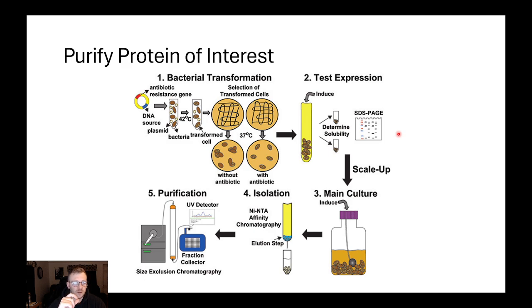And these ones they use, I believe, is a nickel metal that's conjugated onto the bead that is able to have affinity and bind, covalently or ionically, to the histidine residues on the end of my protein, so that my protein will stick to my beads inside my purification column when I run my cell lysate through it. I can then wash the beads in a specific buffer that will cause the beads to release the proteins that were on them, and then I collect them using a collector.